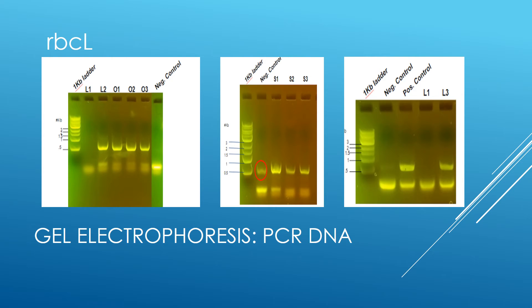As you can see in these gels, samples L2, L3, S1, S2, S3, O1, O2, and O3 were successful, but sample L1 was not. An anomaly, however, was that the negative control had an additional band, not just primer dimer, meaning DNA was present when there should not have been any. This error could have occurred for multiple reasons, such as experimental error.